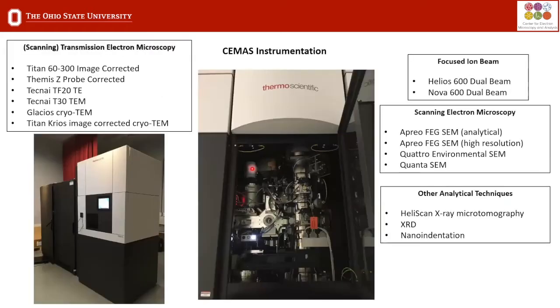One other thing that's always fun to mention is CMAS has a lot of high-end instrumentation here. So a lot of fancy microscopes. And the two dedicated cryo-EMs we have are the Glacios and the Krios. And I will say that the Krios here is probably the fanciest microscope that I've ever used in my life. So it's got all the bells and whistles you could ever want.